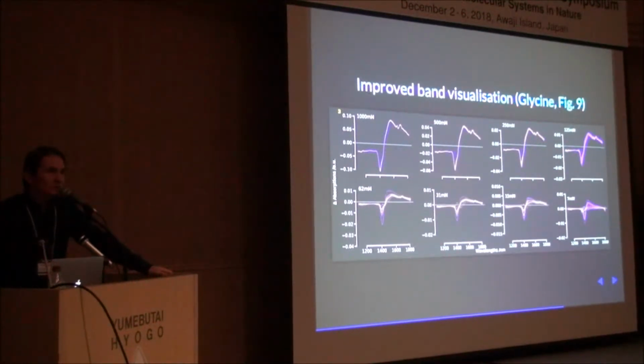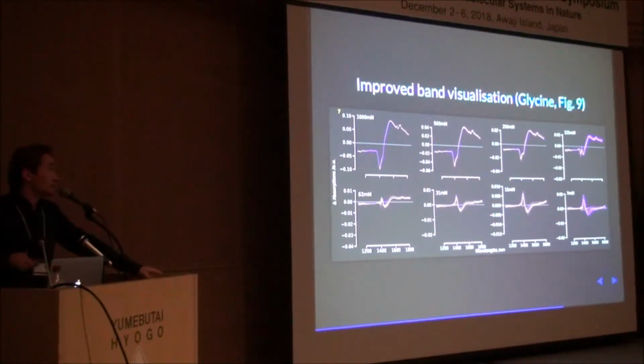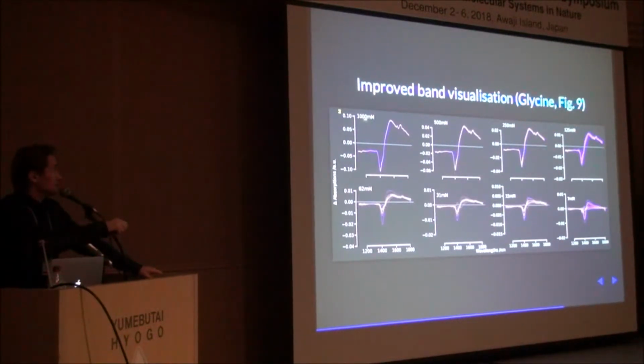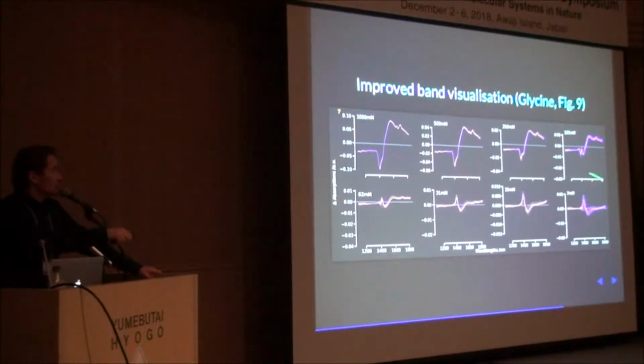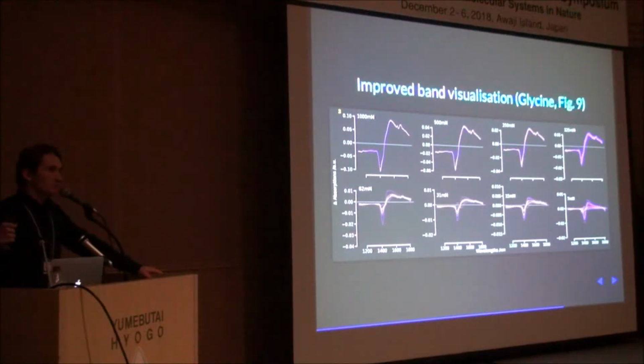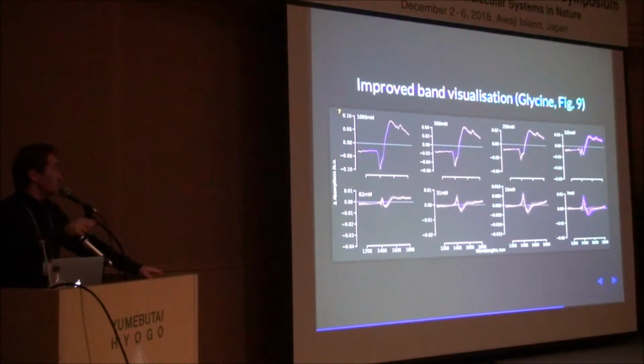That's the common way, and it has not been successful. This slide is trying to explain why. So here I have taken the spectra of a solution, in this case glycine. This is 1 molar, and these are in dilution order. Here I'm averaging all the first consecutives in these 10 experiments and subtracting. And then I'm averaging all the second consecutives.